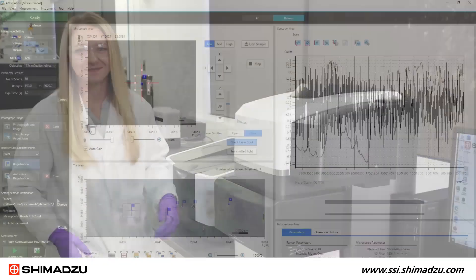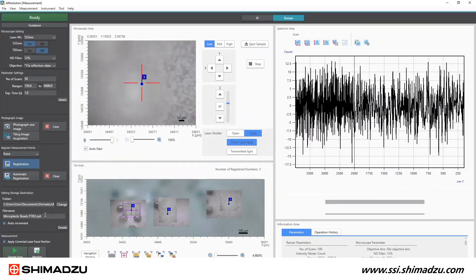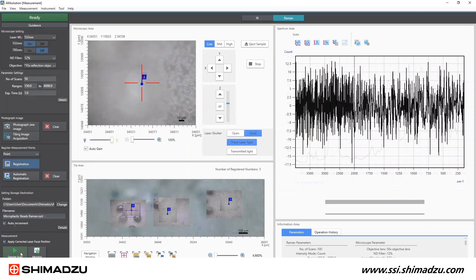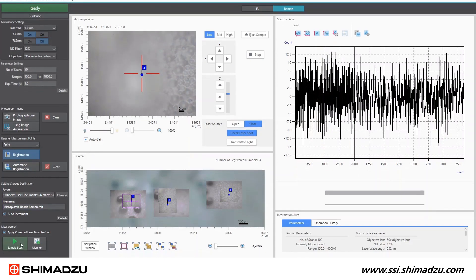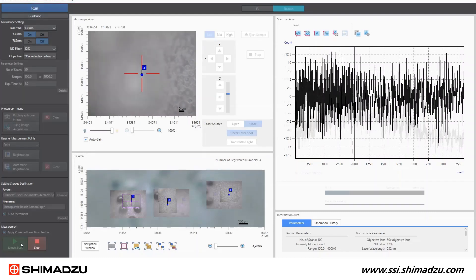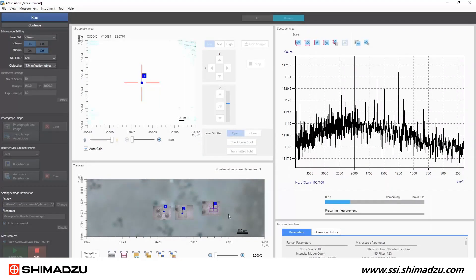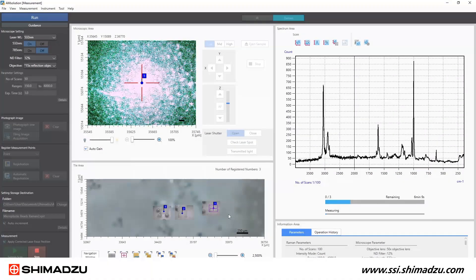The last step in the Raman measurement setup is selecting what to name the data file and where to save it. I like to check this auto increment box so the data is saved with an ascending number at the end of the file name. Now that all of the images are captured and points are registered for the Raman microscope, I can click the green sample scan button at the bottom and the AIRsight will automatically move to each point and collect Raman data.